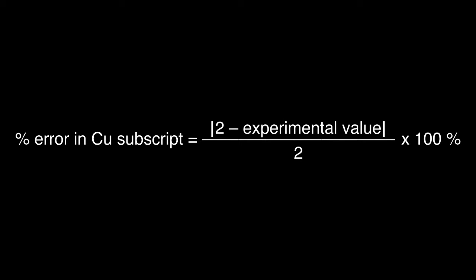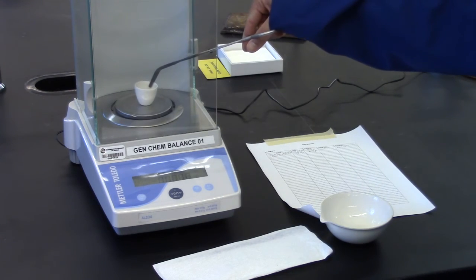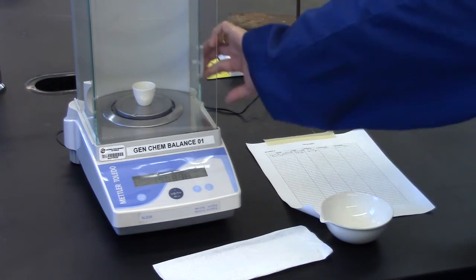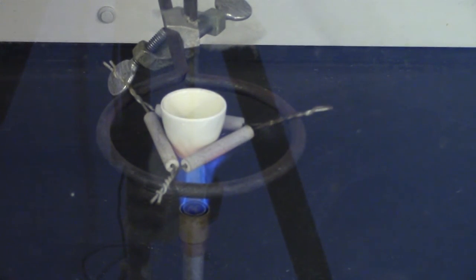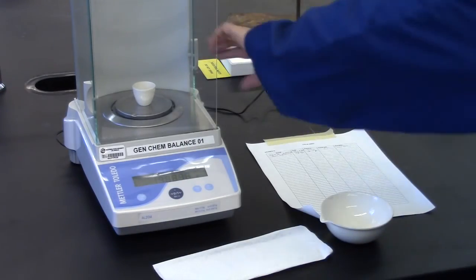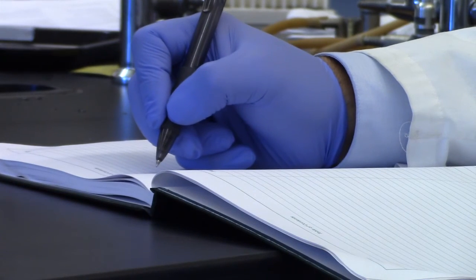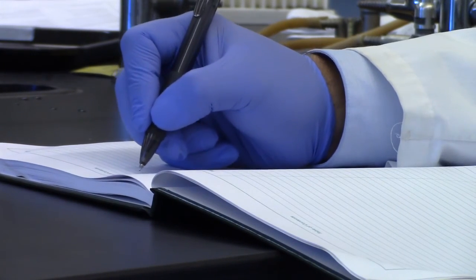Percent error in copper subscript equals the absolute value of 2 minus the experimental value, divided by 2, times 100%. If the copper subscript is high, the crucible plus product should be reweighed because it might have not cooled sufficiently. If the copper subscript is low, heat the crucible and contents for 30 seconds to a minute on high heat. Cool and reweigh. If the percent error is less than 10%, it is not necessary to add sulfur and reheat.